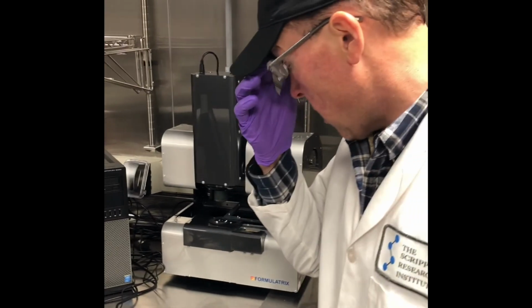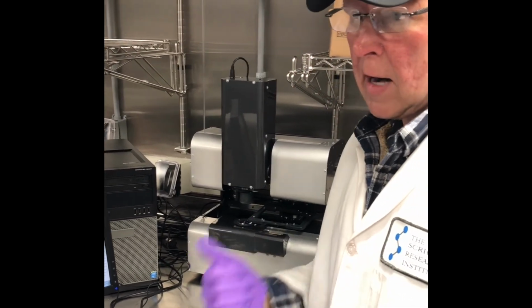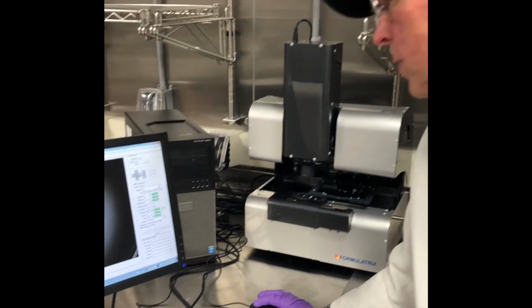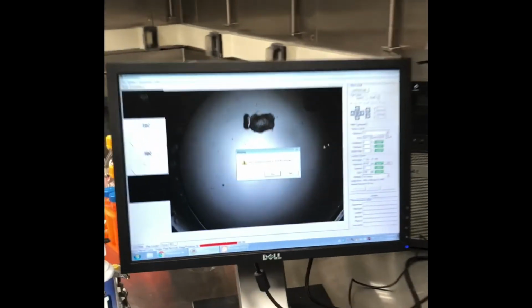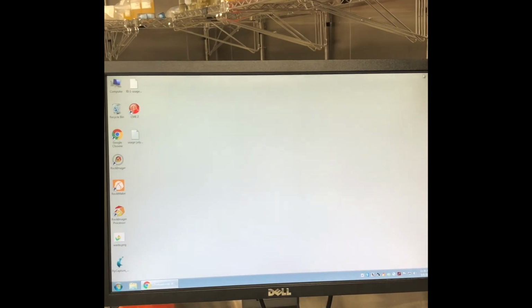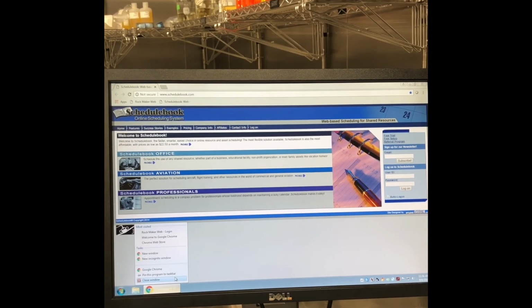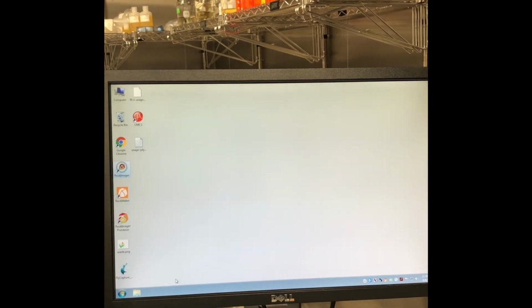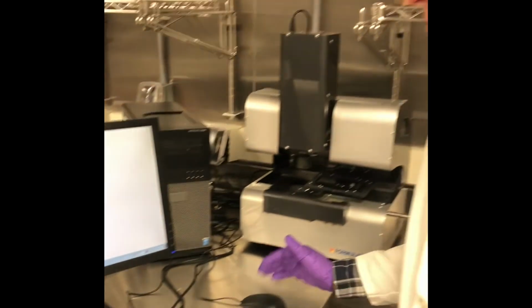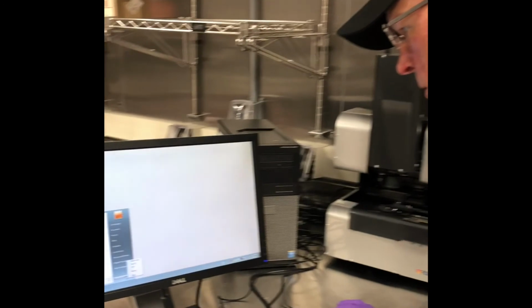So when you're done, unlike the RI-1000, which you want to leave Rock Imager running and logged in as Windows all the time, the RI-1, close Rock Imager, yes, close RockMaker, and I guess you can close this. And again, make sure you sign up for this. If you're going to use it remotely, you're going to have to be signed up here because no one else can use it if you're using it remotely. And then log out of Windows.